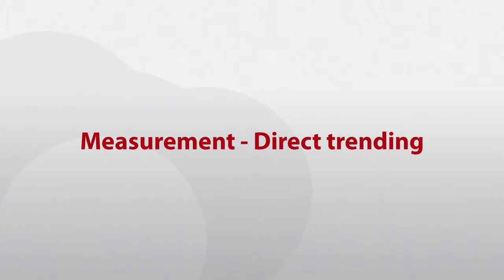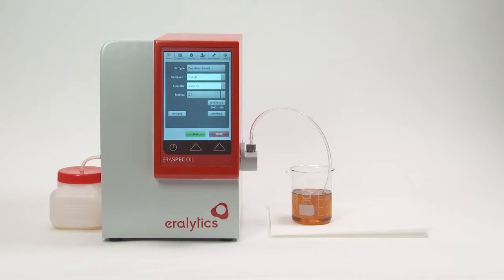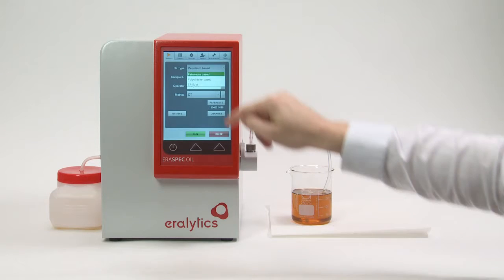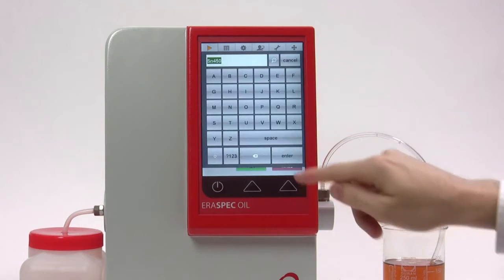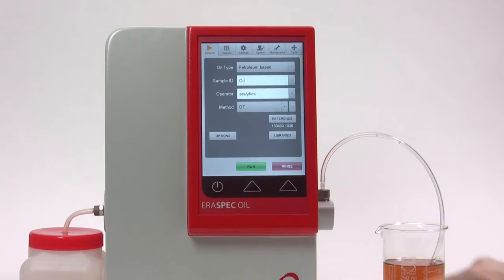Making a measurement. Direct trending. To make a measurement, oil type, sample ID, operator and method must be selected. Select the oil type for the oil that shall be analyzed. This will determine the standards that will be used for evaluation of the spectrum. To enter a sample ID and an operator, click on the fields and enter the name via the keyboard or select stored names from the drop-down menu.